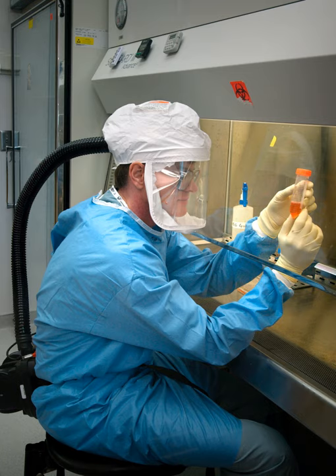A biosafety cabinet (BSC), also called a biological safety cabinet or microbiological safety cabinet, is an enclosed, ventilated laboratory workspace for safely working with materials contaminated with or potentially contaminated with pathogens requiring a defined biosafety level. Several different types of BSC exist, differentiated by the degree of biocontainment required. BSCs first became commercially available in 1950.